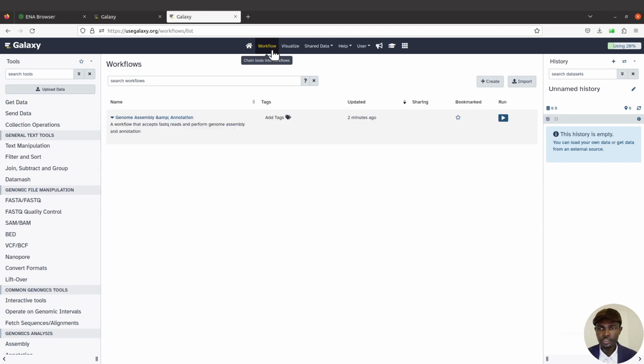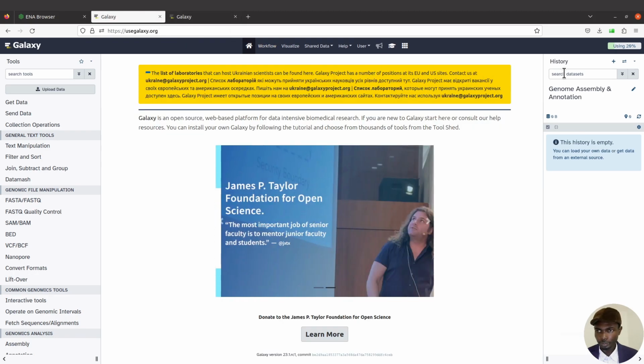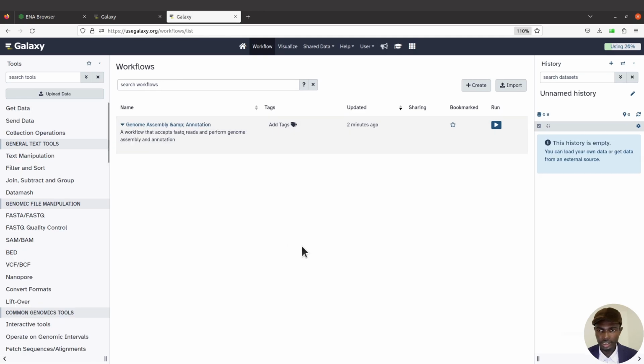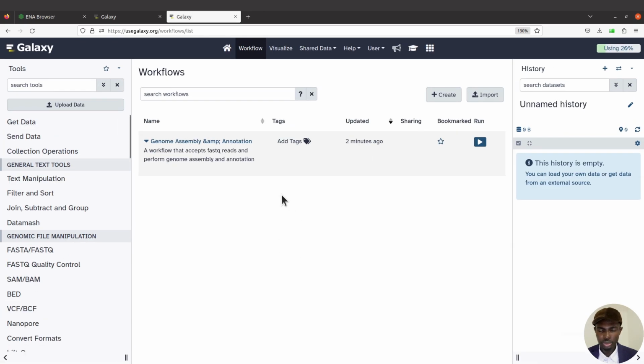Okay, this is different from the workflow, which is here. So we take note of that. Now, let's do this. If you go to your workflow, you will see the workflow being displayed for you. Sometimes the name may change, like in this situation here. If the name has changed, you can still come to this side. Let me just show you how to rename it.